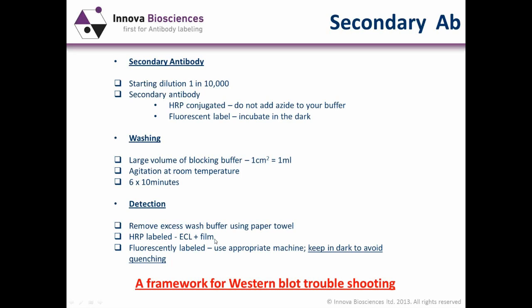Sometimes the exposure time would be a matter of milliseconds versus an hour or two, sometimes overnight. Again, it all depends on how strong your Western blot is in regards to its signal, and that involves the primary and the secondary.